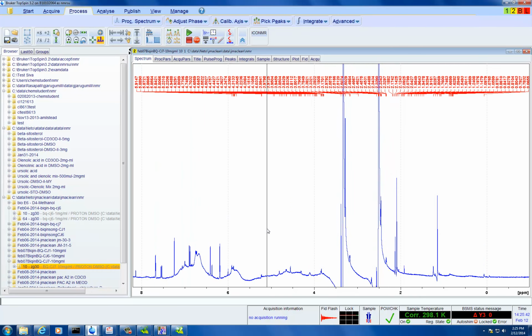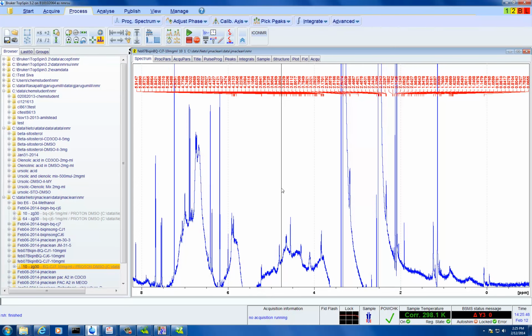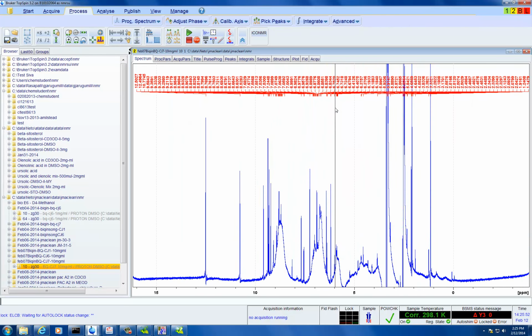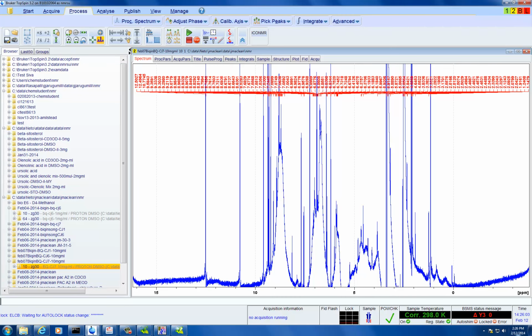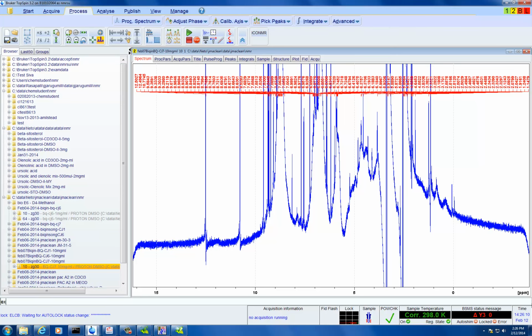Oh, wow. So how do we qualify and quantify it? There are ways to do that, though it is difficult, as you can see. I'm just going to see how long this experiment is. 5 minutes. Yeah.